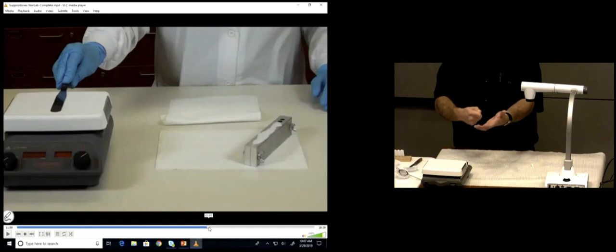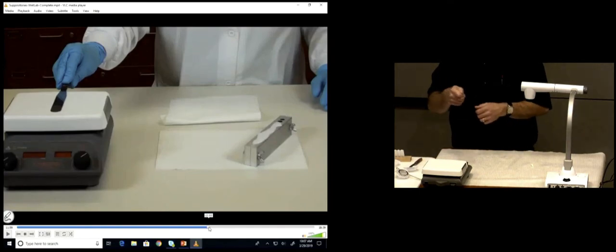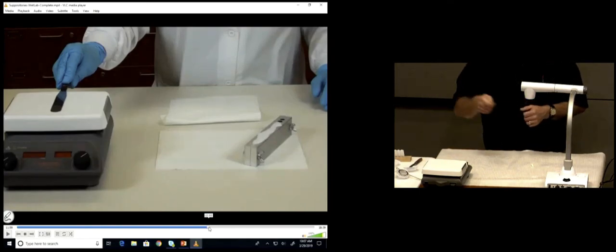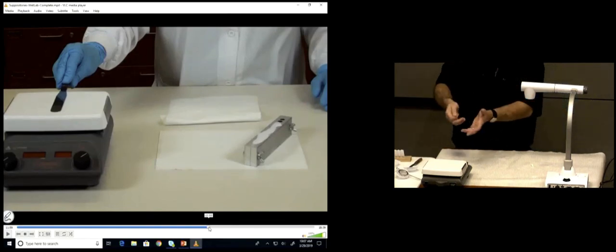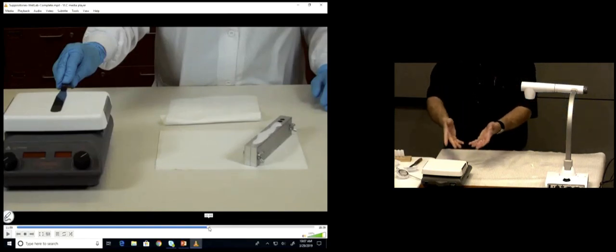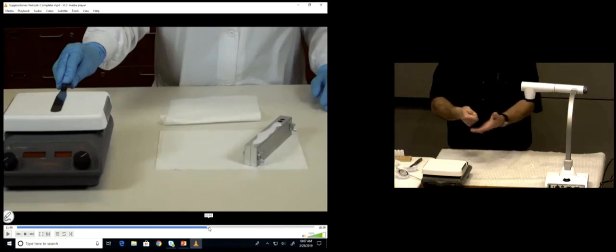If it's not radiating heat, then it's not going to help you melt the base as you cut through there, okay? And you do more of a samurai chop, and it makes chunks come out. So it's better that it's nice and hot. You know, it doesn't have to be on fire, please. But again, warm. I can definitely feel heat coming off of that.